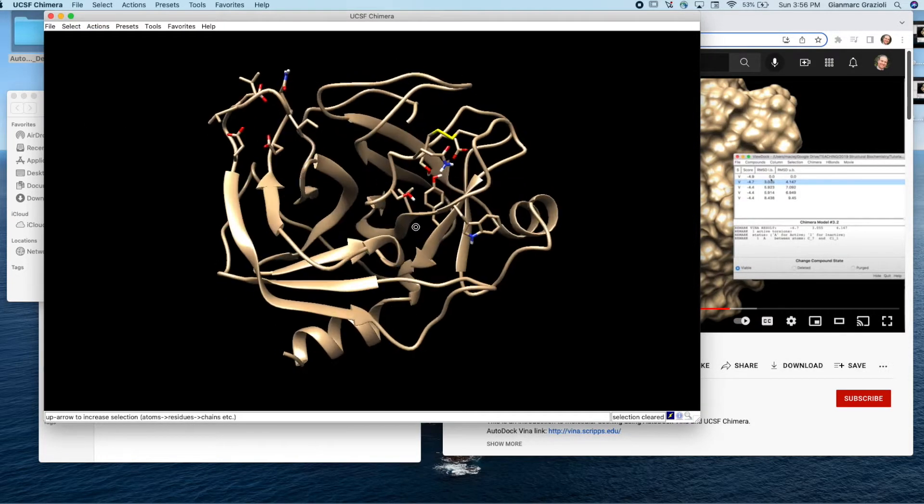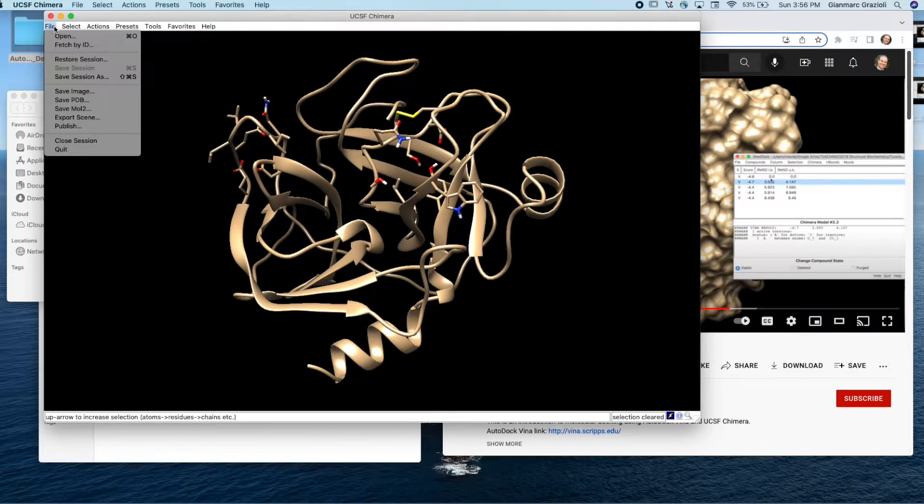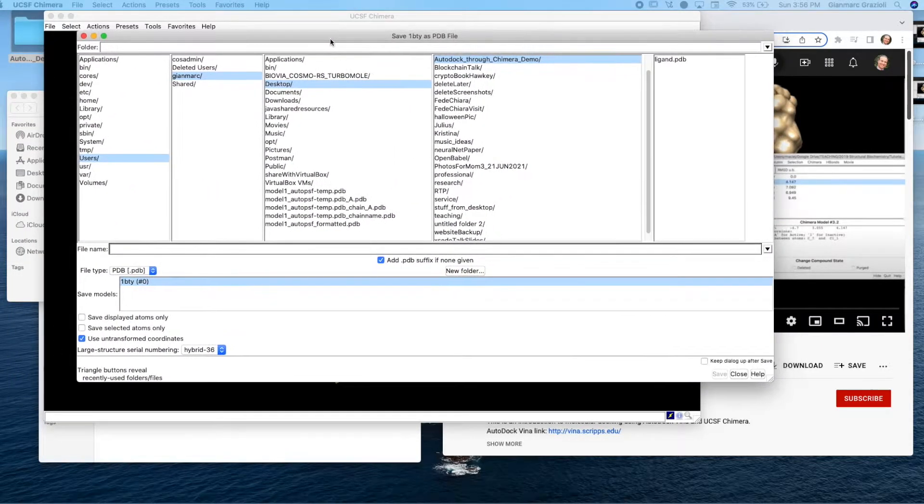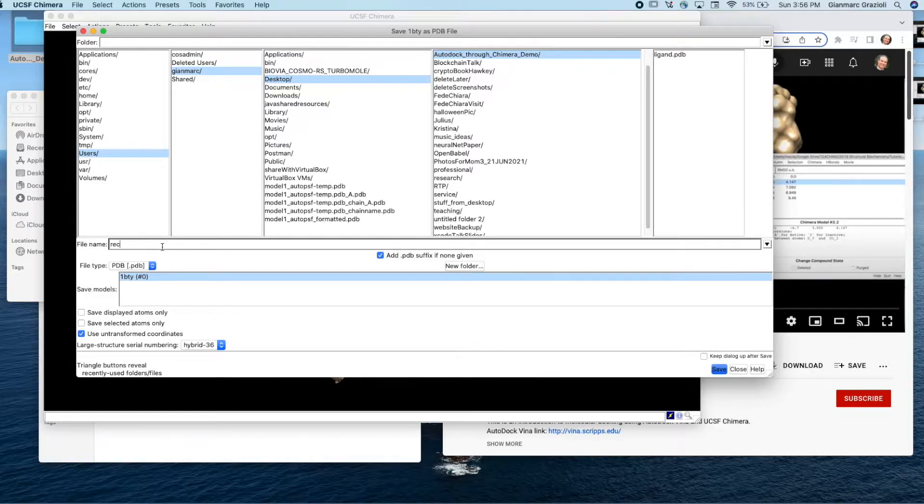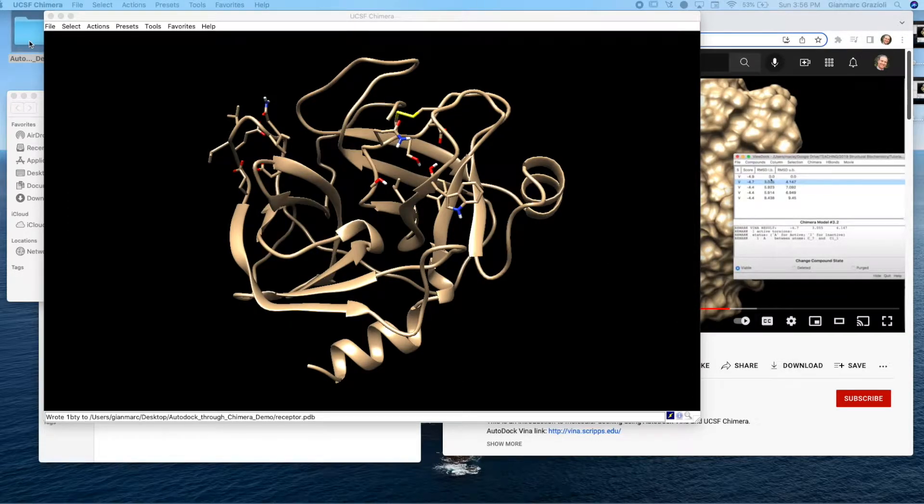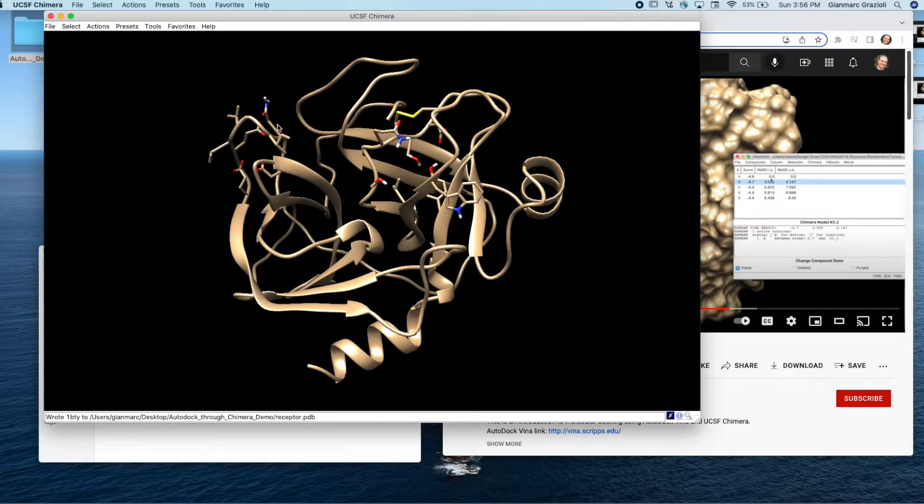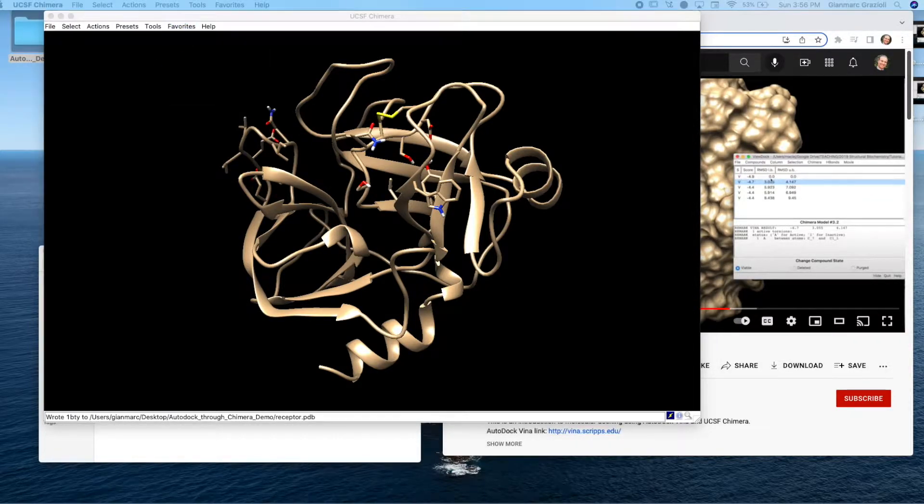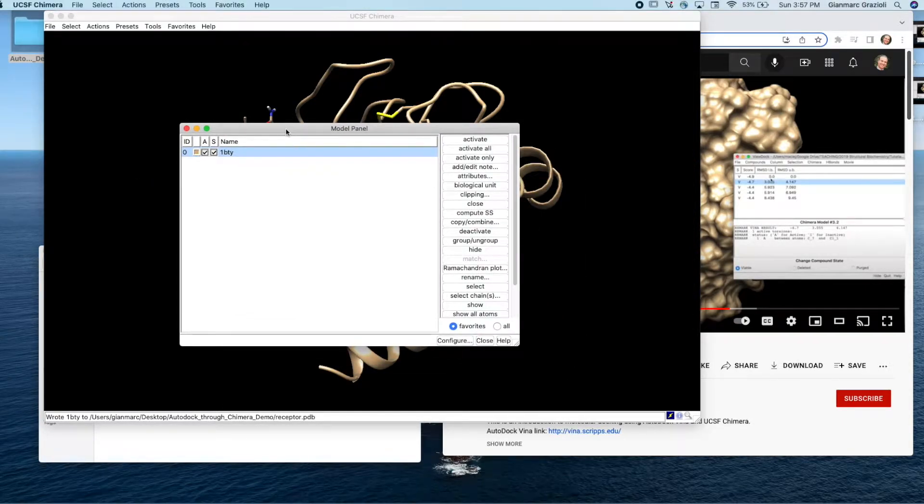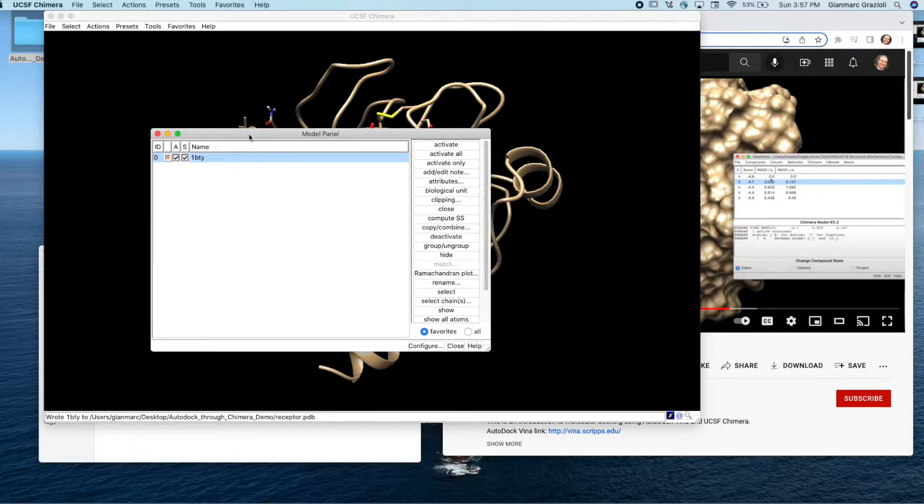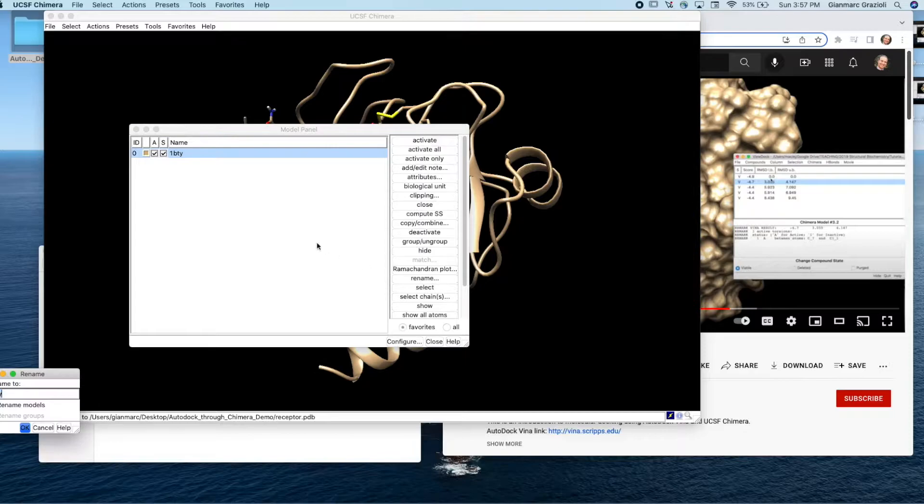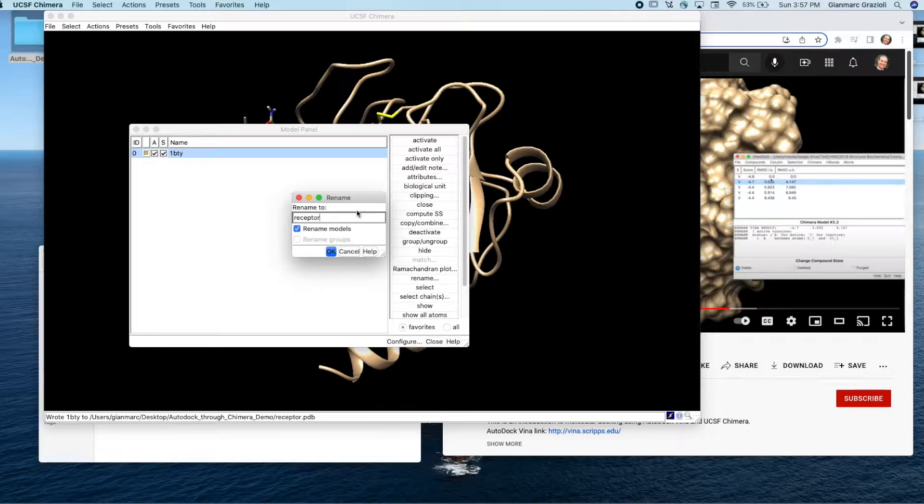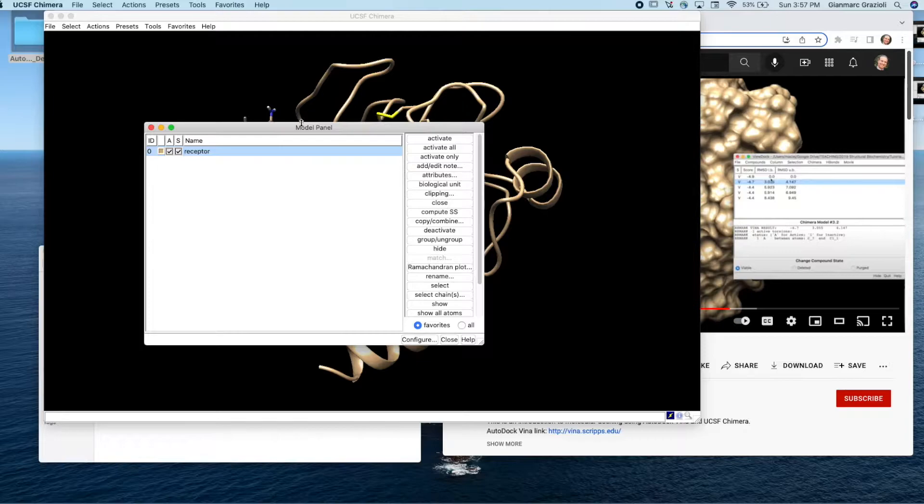So now we have only the protein here. So now we want to save this as well. We're going to say file, save PDB. We're going to call this thing receptor to stay consistent. Save. And if we look in here, indeed, it did save a PDB for receptor. Now if we go to favorites and then model panel, it shows us a little panel of all the models that are loaded. We note that this thing is still called one BTY instead of receptor. So we might as well rename that to be consistent. Let's call this thing receptor. So we've renamed that.